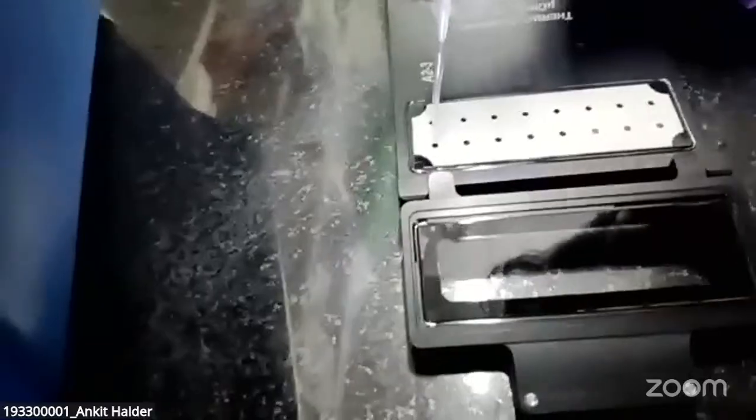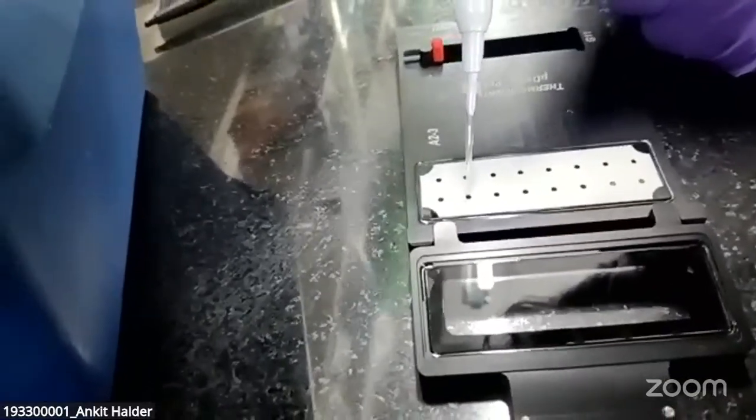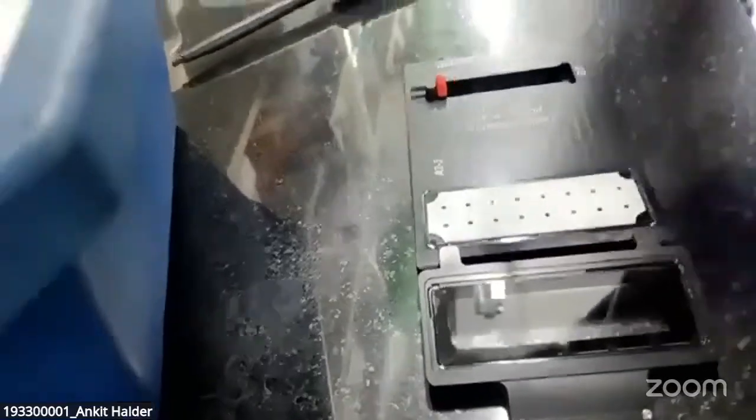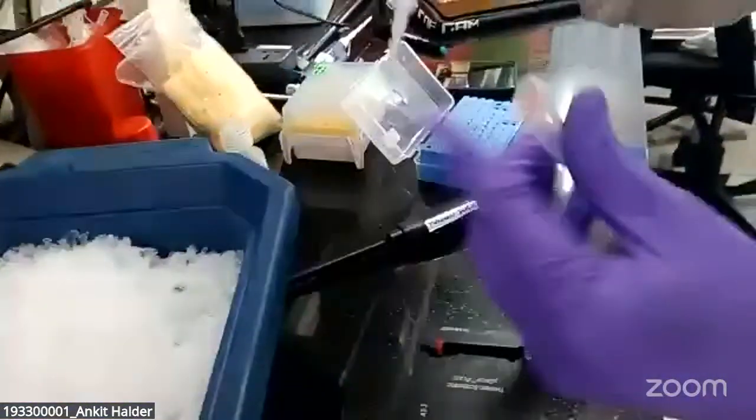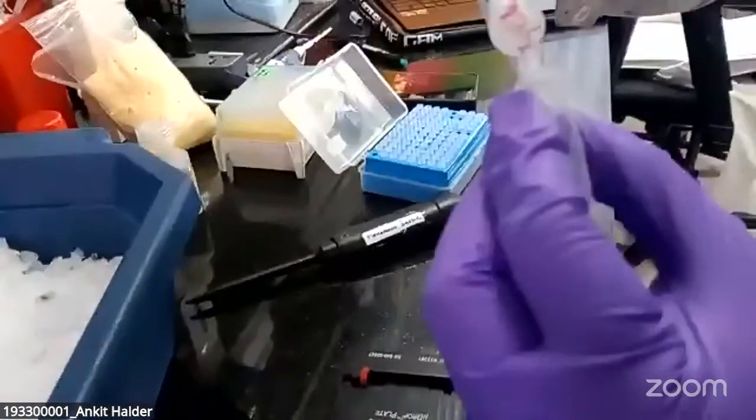I'm going to keep it here. Again, I will be doing it in replicate to minimize any kind of variation.